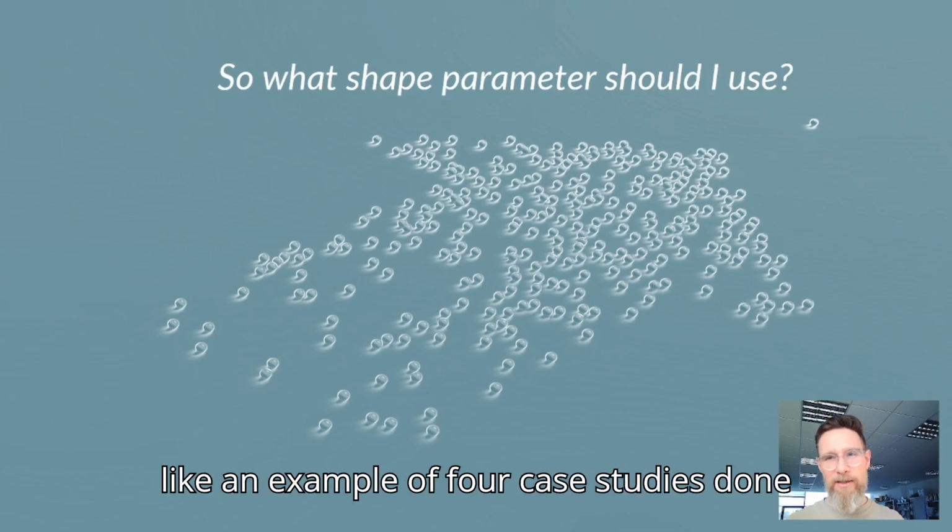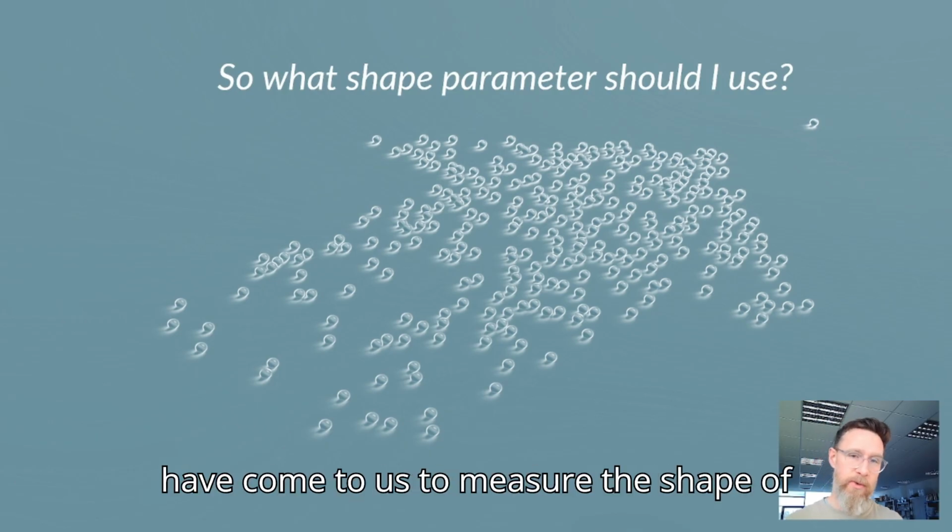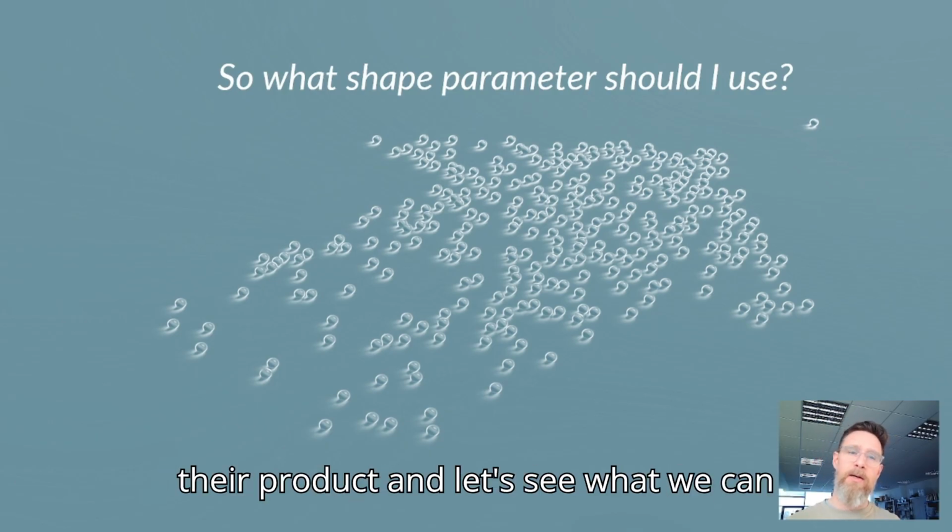What one actually matters? So we're going to give an example of 4 case studies done here, 4 applications where customers have come to us to measure the shape of their product. And let's see what we can infer from the data.